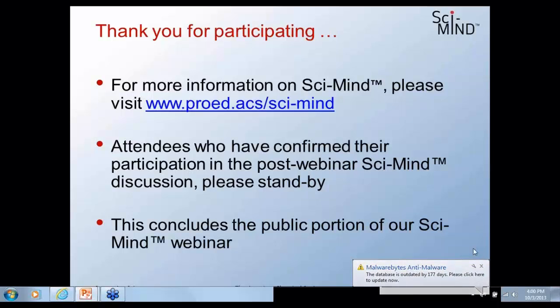Here's another question. It says here, I've got 3 kinds of samples in a mixture. How can I identify a peak of each sample? That can be a really challenging problem. I'm going to assume that we're talking about a really complex mixture, perhaps with multiple phases present. That's one of the things where I'm probably going to look at the sample preparation as much as the chromatography to help me with that selectivity.